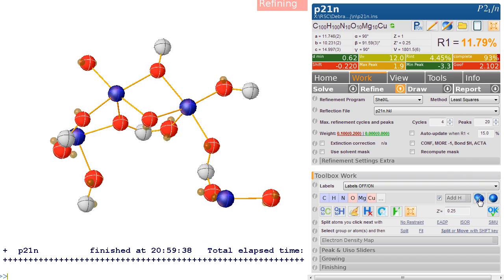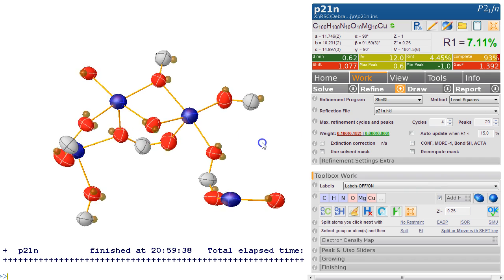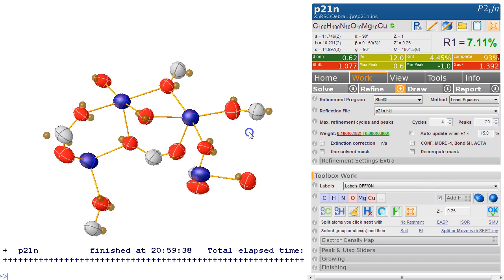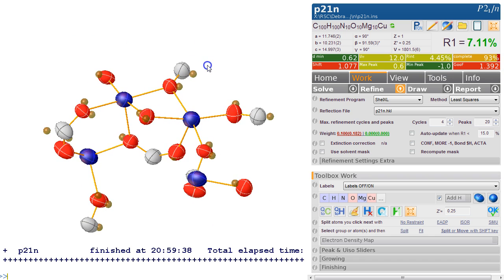Because this is ticked, it refines automatically and we get an R factor of 7%. So that's fairly good. Now I'm not convinced that these are actually copper because they look too big.